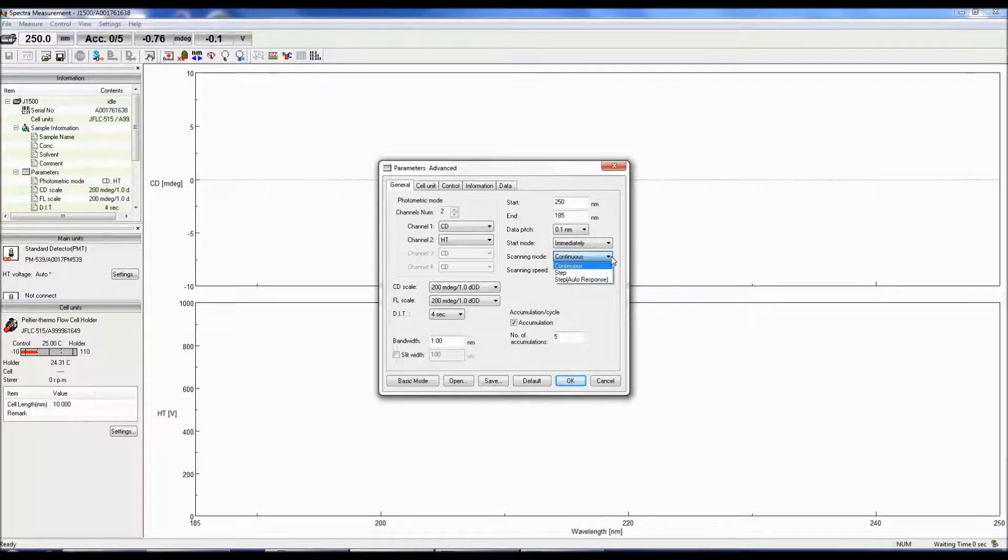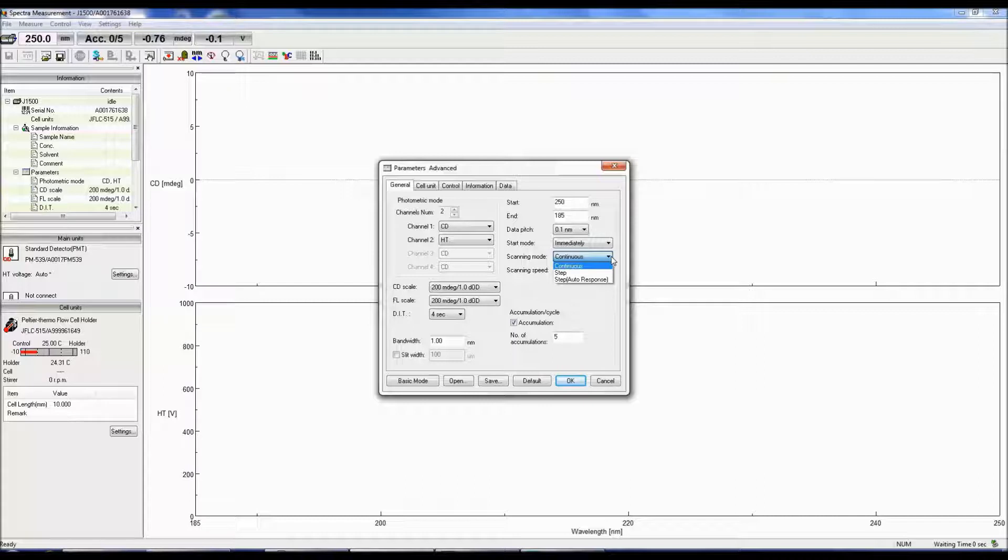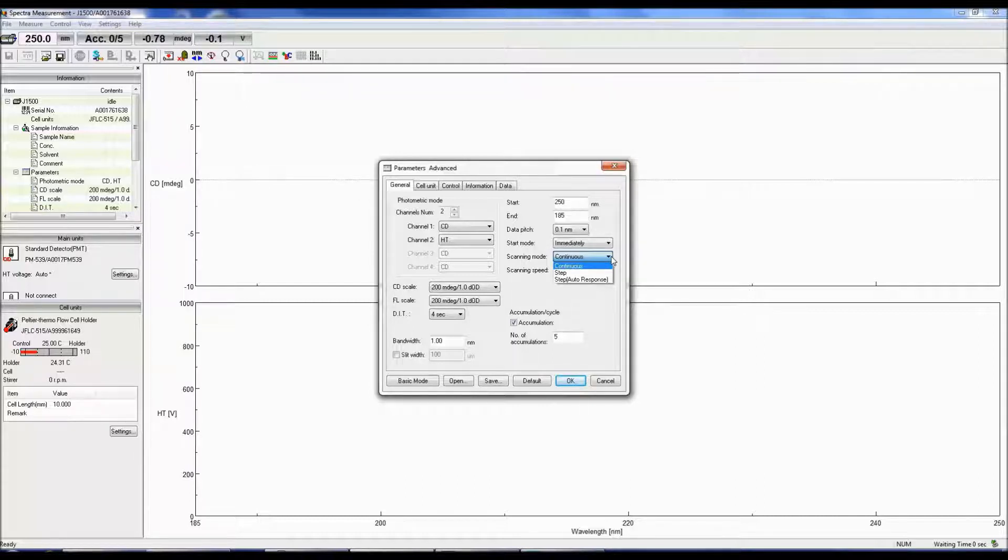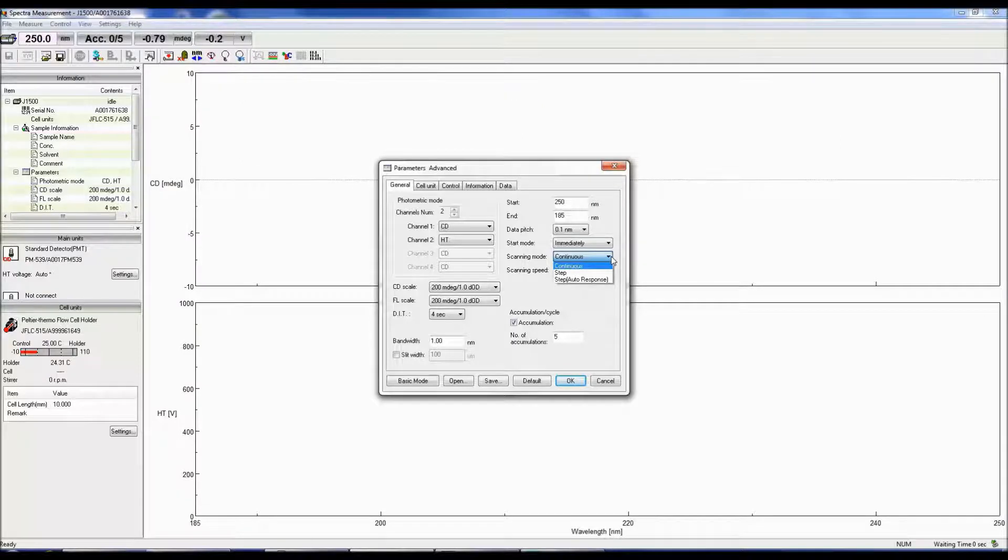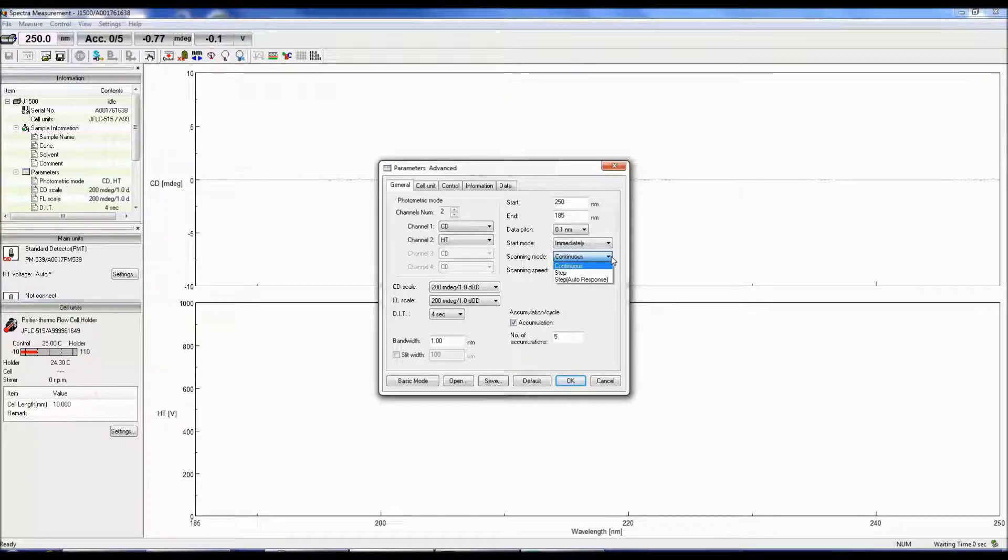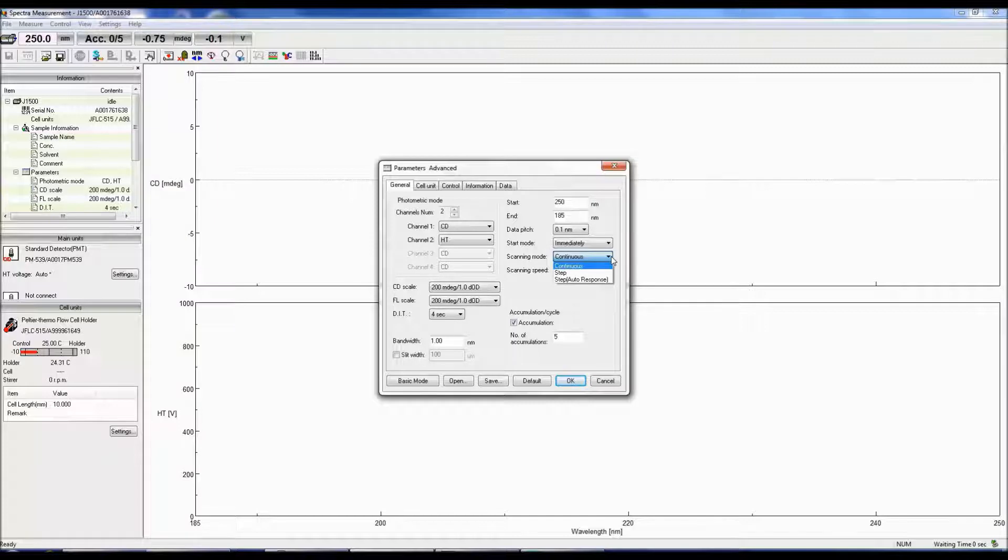The continuous scan acquires a CD signal at each wavelength while moving across the desired wavelength range. Step scan stops the monochrometer at each wavelength to obtain a CD signal. The step scan takes much longer to acquire a CD spectrum than the continuous scan mode.